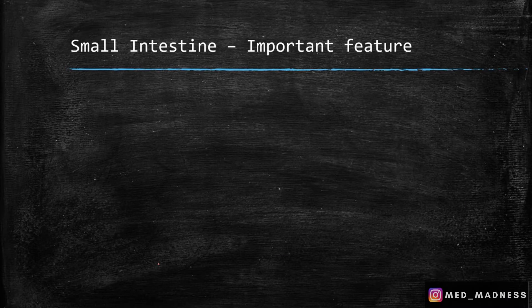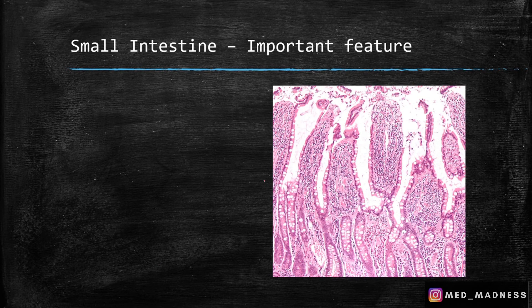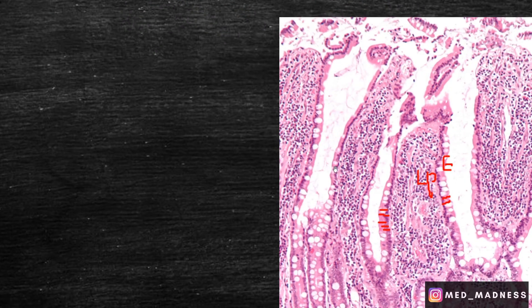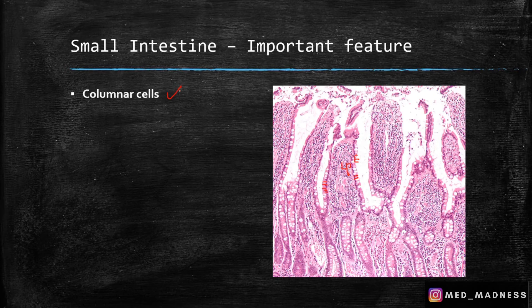The final layer is the serosa or adventitia. Now let's see important general features of the small intestine. This is the small intestine — you can see the epithelium and the lamina propria. The type of epithelial cell present in the epithelium is columnar cells. Let me zoom this image for you so you can see the columnar cells here.